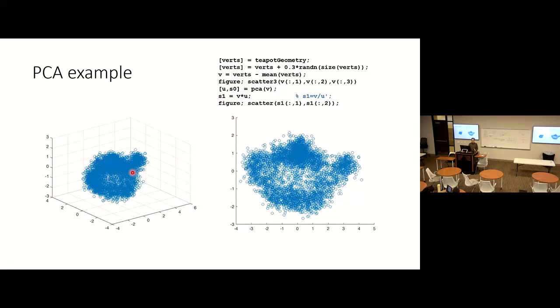In MATLAB, for example, you can rotate this cloud of data to look at it from any angle. You can reduce the dimension from 3D to 2D, which is what you are seeing on the screen right now. From any angle, you can stop and look at this cloud of data.